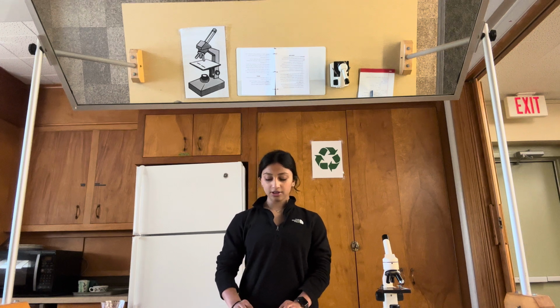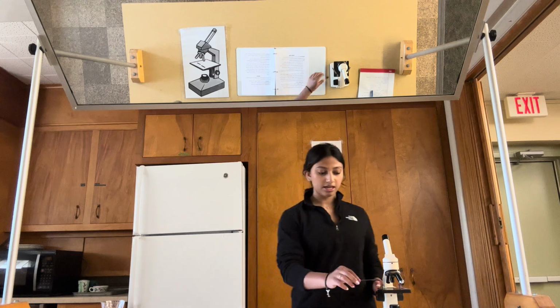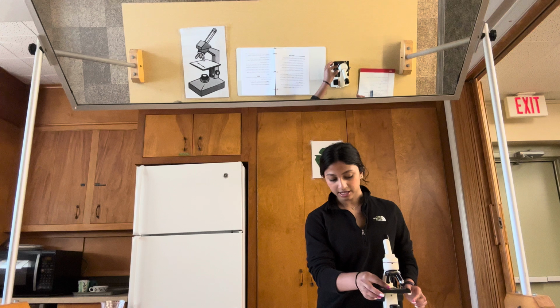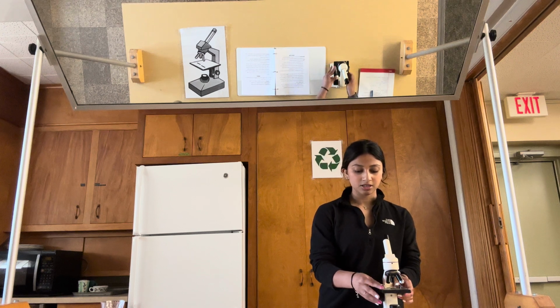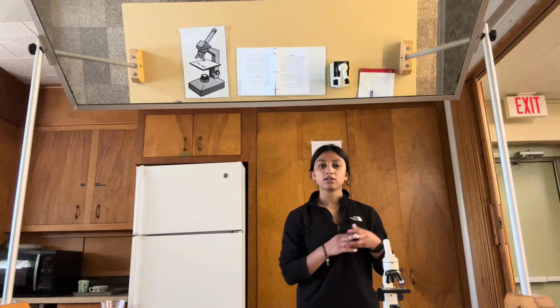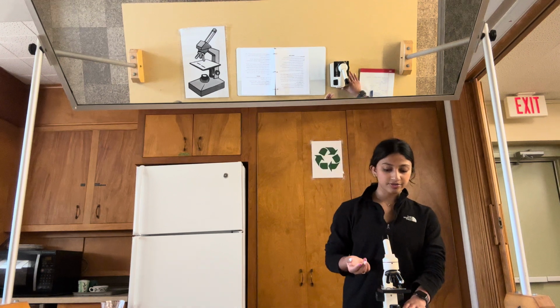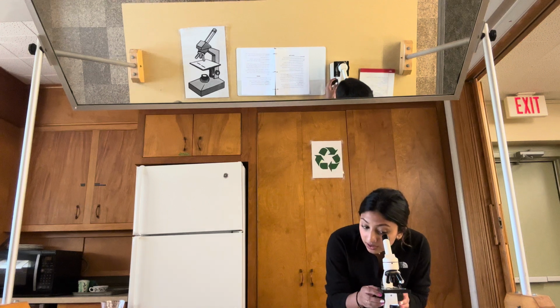You're going to handle the slide on the edges with your fingertips and place it on the stage in the center, covering the hole, and then use the clips to secure the slide in place. You want to make sure that you begin on the lowest setting and work your way up accordingly. So we're going to first turn it on to allow the light to pass through the sample and view this sample.